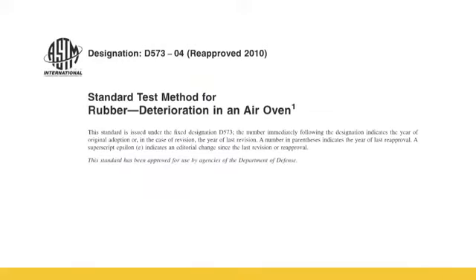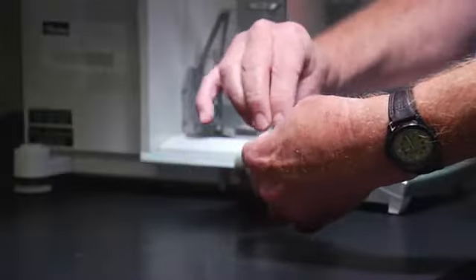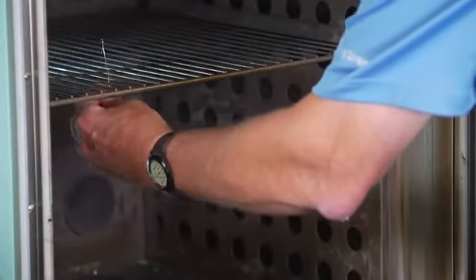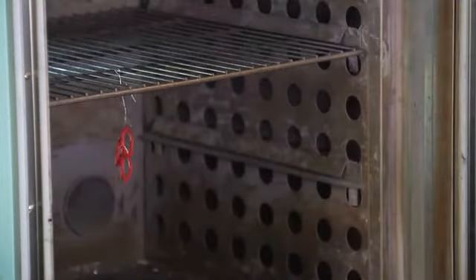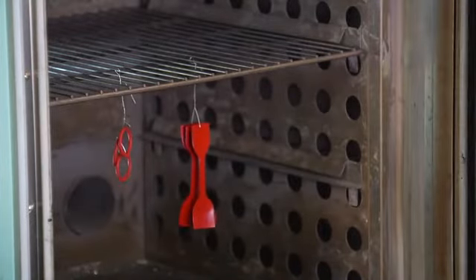Heat aging is another method for comparing differing O-ring materials and can be performed on O-rings or test platens. Heat aging refers to the change of physical properties when compounds are exposed to temperatures at or above the upper operating limit for the compound. Elevated heat can cause chemical changes in any compound, and this test is a way to identify the impact of that heat. Heat aging is performed by taking either O-rings or platens and placing them in an oven or heated chamber for a planned time and temperature, based on the known limitations of the elastomer family.